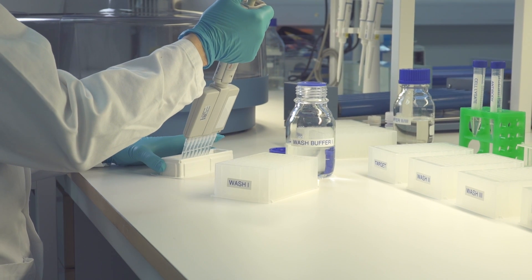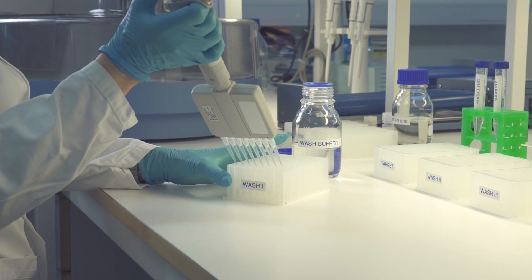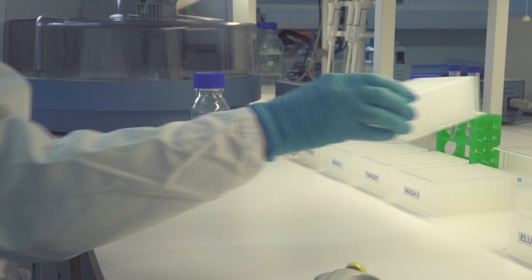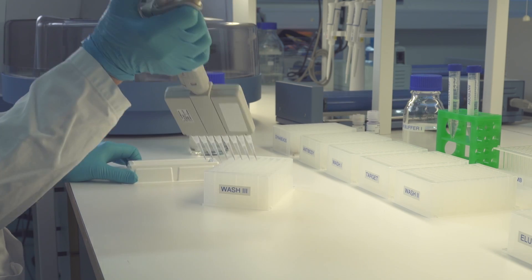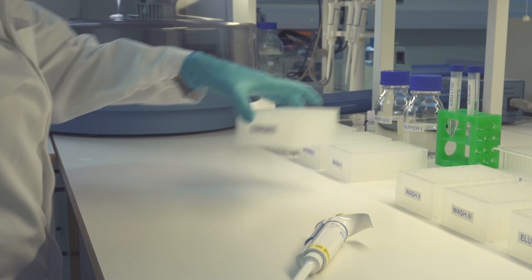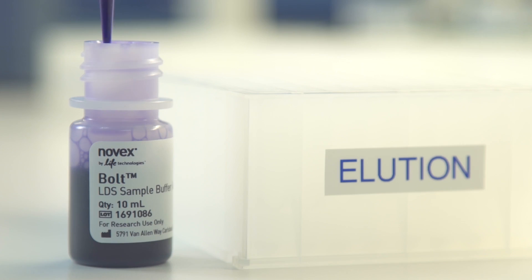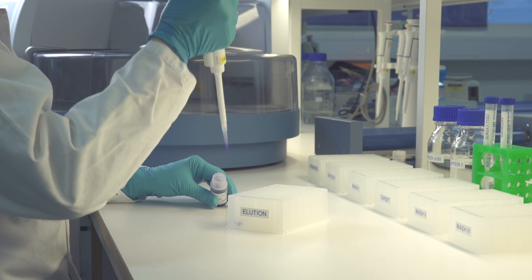The protocol includes three washing steps: one after antibody binding and two after target capture. The protocol is designed for 200 microliters of target sample. The final step is the elution. The prepared plates are now ready to be loaded onto the instrument.